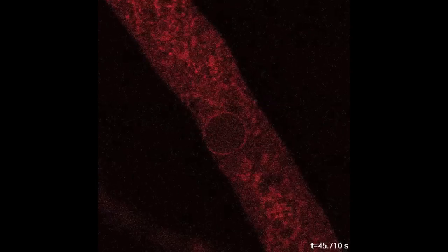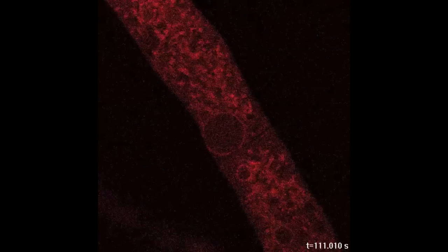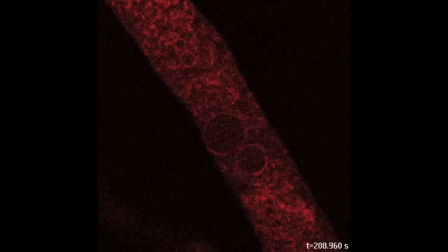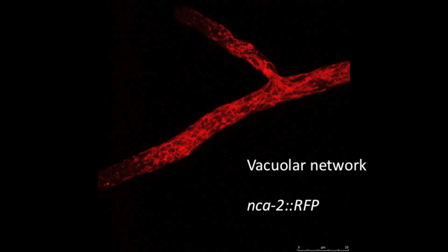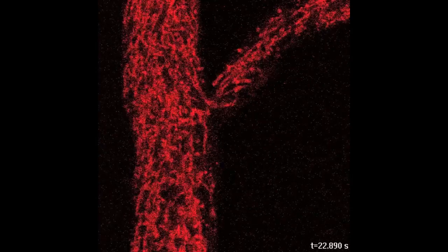We tend to think of vacuoles as large spherical organelles, and in fact, big round vacuoles are common in Neurospora, especially in older hyphal compartments. However, the vacuolar compartment is more complicated in its structure. If we look at the tip, we see few vacuoles, just in the form of a few small vesicles.